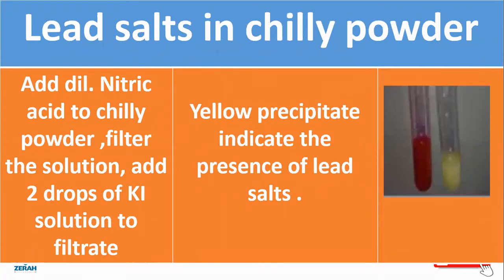Next, to find out the lead salt in chili powder, add dilute nitric acid to the chili powder and filter the solution. Add two drops of potassium iodide solution to the filtrate. A yellow precipitate indicates the presence of lead salts.